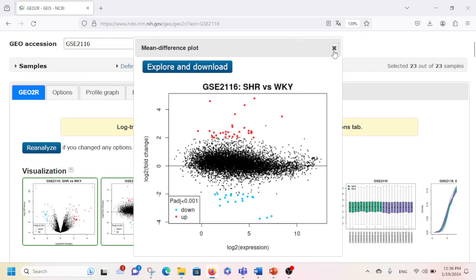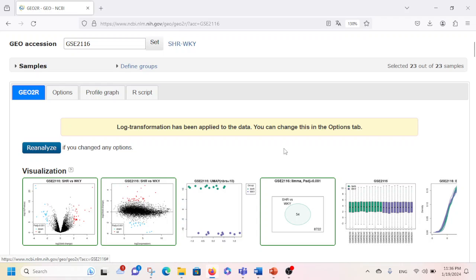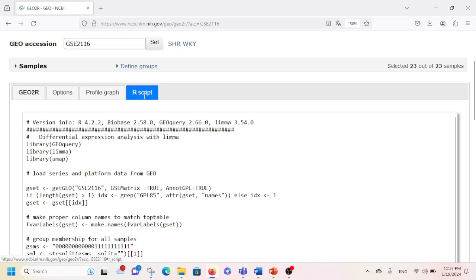This is how you can reanalyze the data — you can change the p-value, change the log2 value, and set stricter criteria for your analysis. If you want to look at the R script for the last analysis performed, you can click here and it will display the R script. You can also save it as a file.